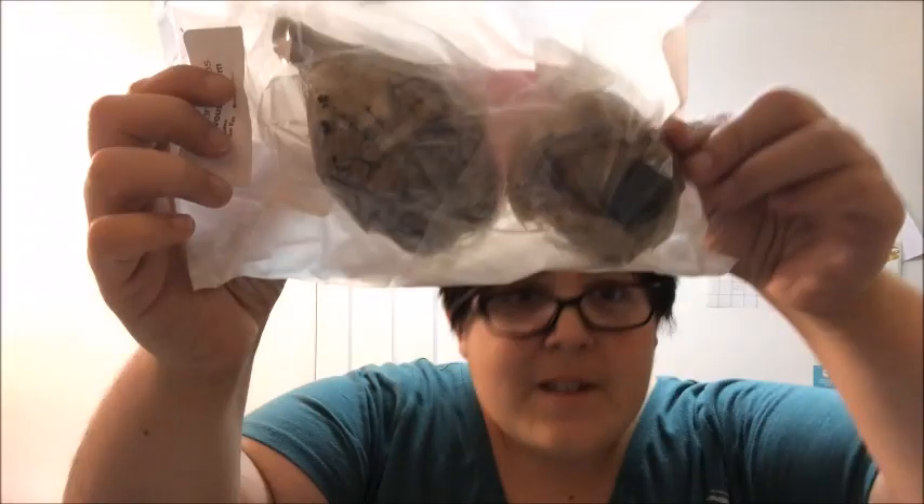Then there are paper clips and a roll of masking tape. For the nervous system, these are the things we are dissecting. It says store at room temperature, out of direct sunlight, keep out of reach of children and pets. If you guys are interested, I can try to film the actual dissection. We haven't reached that level yet, but here's the eye and here's the brain. There's also a fine-tip marker from Staples.